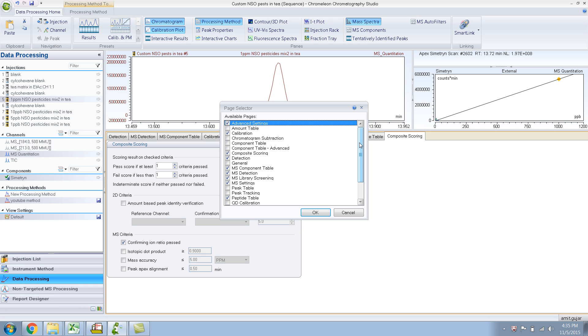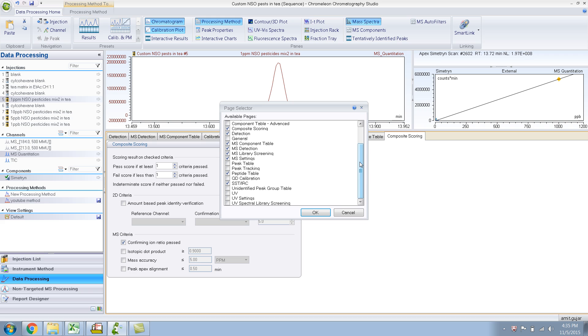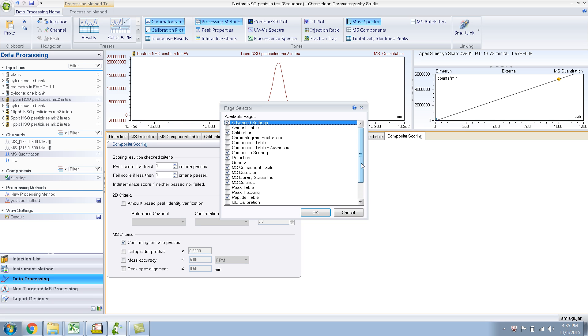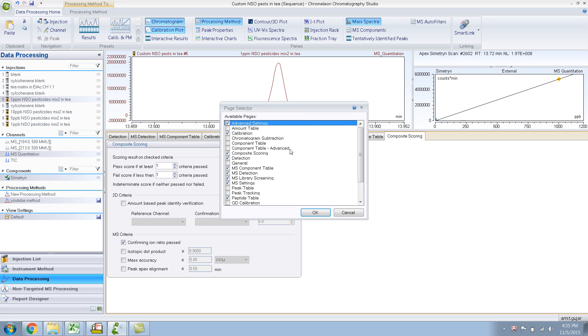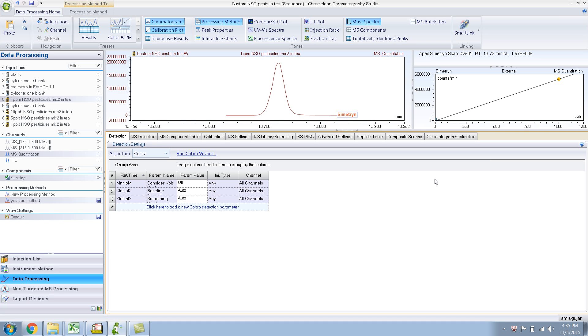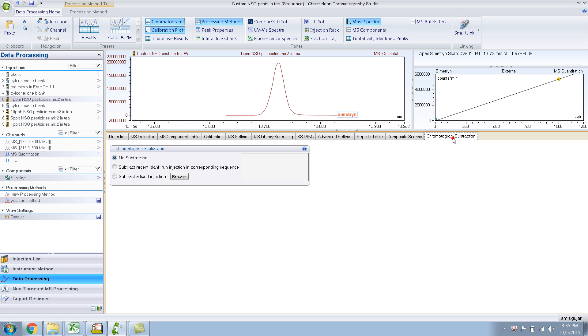What you see over here, for example, let me show you one of these is chromatogram subtraction. As soon as I do that, a new tab shows up, which is chromatogram subtraction.